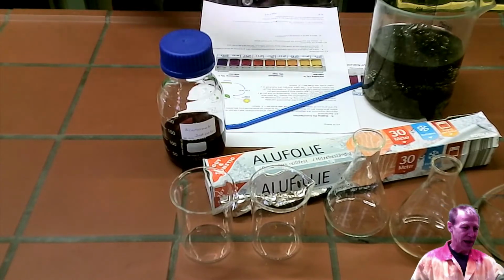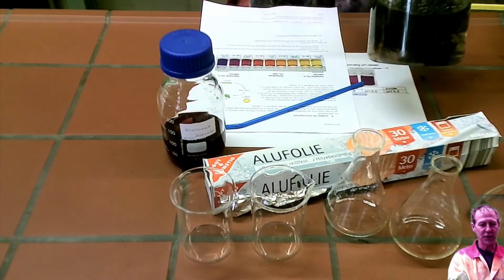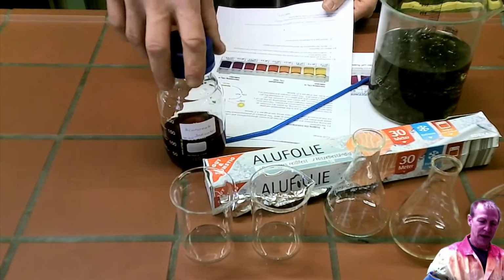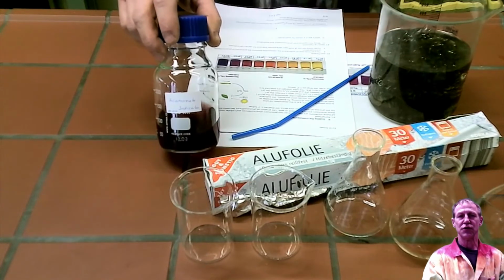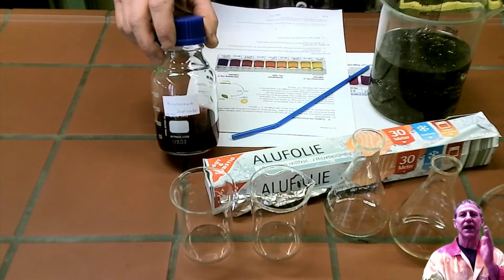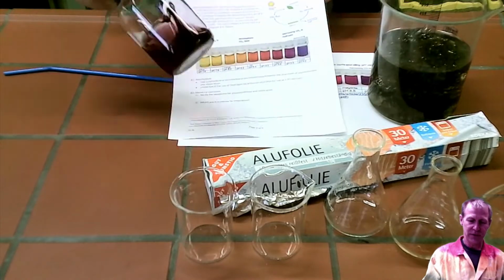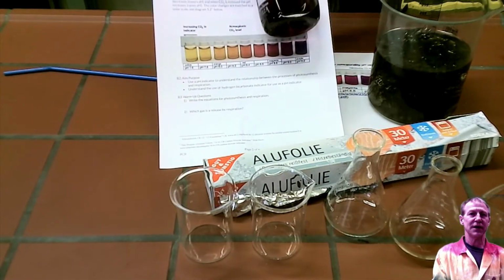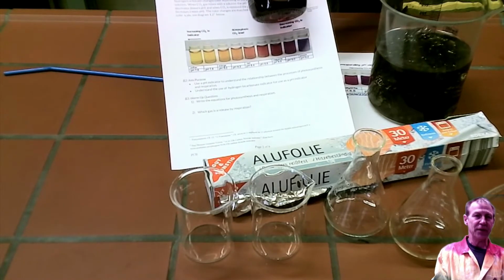As you can see, I have some flasks, 2 beakers, aluminum foil. I have Elodea, which is an aquatic plant. There is a straw, and we have a solution called bicarbonate indicator. This is the solution that is used to measure the carbon dioxide gas in the system. And then there is a scale here that is used to determine how much carbon dioxide there is in a solution, and it is dependent on the pH of the solution.